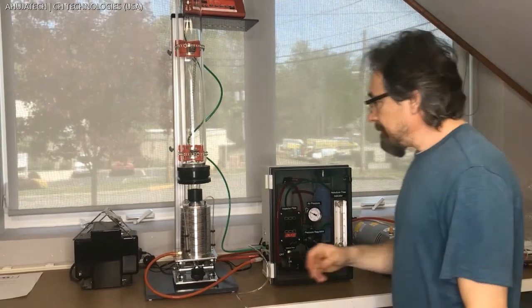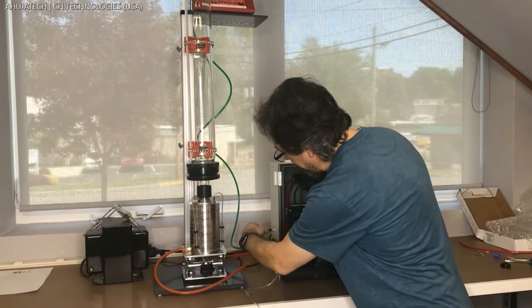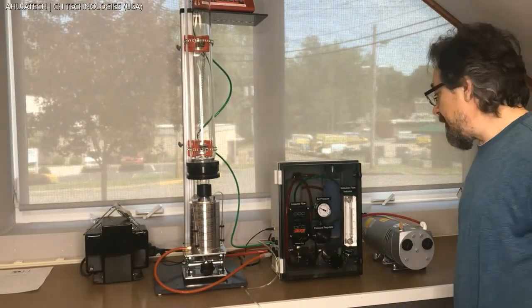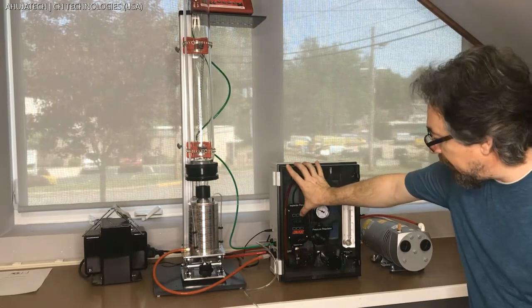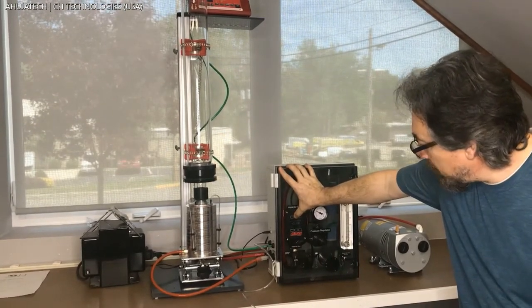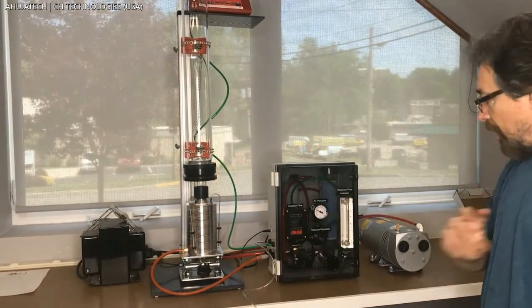Next we turn on the pump, and we turn on the mass flow controller by plugging in the power adapter. We set the flow rate — the procedure will be written in the manual — but basically we press the set point button and then move left or right to select the digit we want, then move either up or down until we achieve the desired flow. In this case, 28.3 liters per minute as required by the method, and then click set. We are good to go.